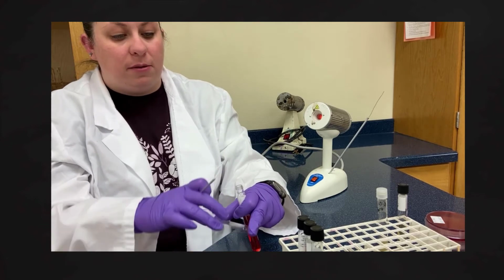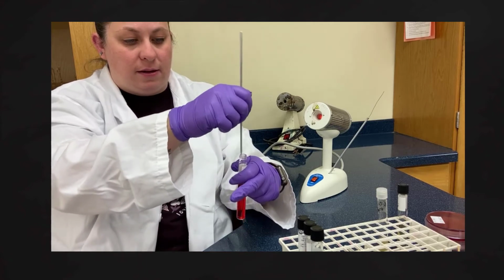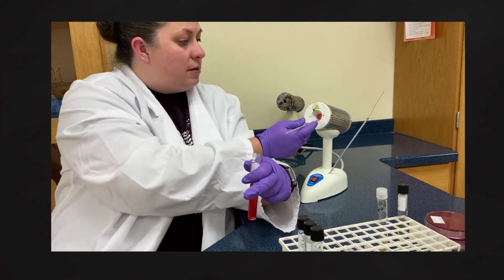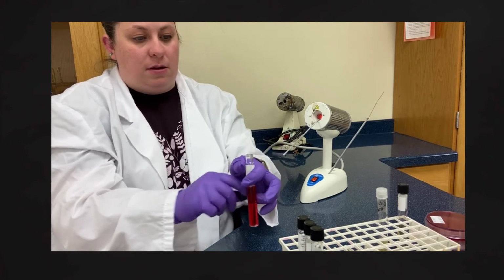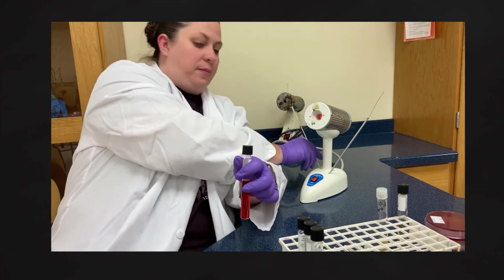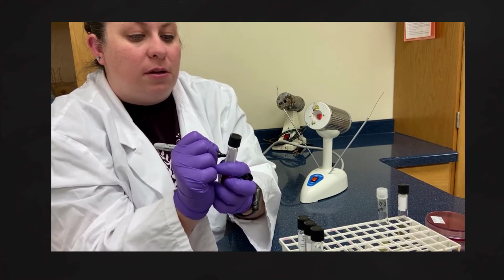So in this case, we're going to pull the lid up, collect some of our bacteria, and then we're going to place it in there. Okay, and sterilize our loop. All the way on, and then half a turn to open it up. Again, making sure we label our tube.